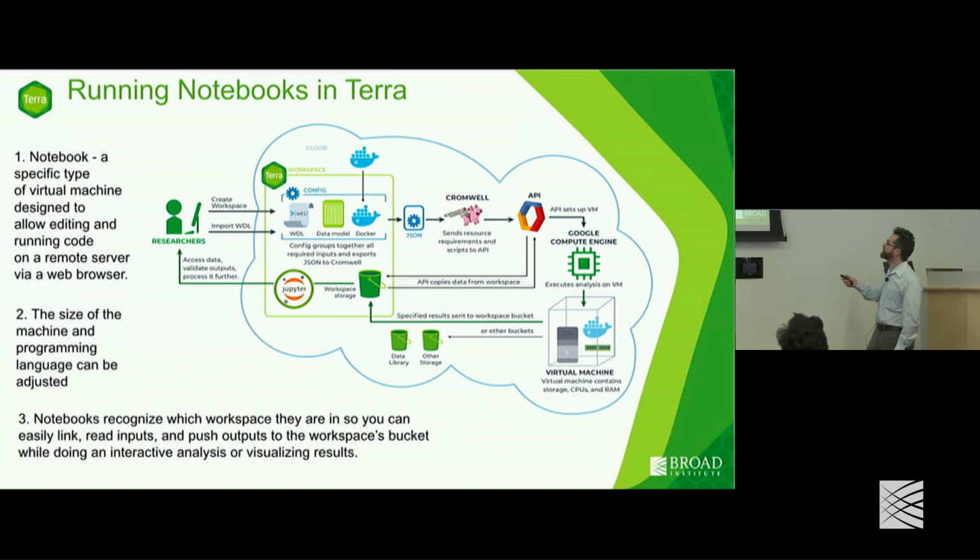And inside of the workspace, we have, broadly speaking, two different things. We have the analyses, the workflow analyses, which you can launch, and you'll learn much more about that towards the end of the day.